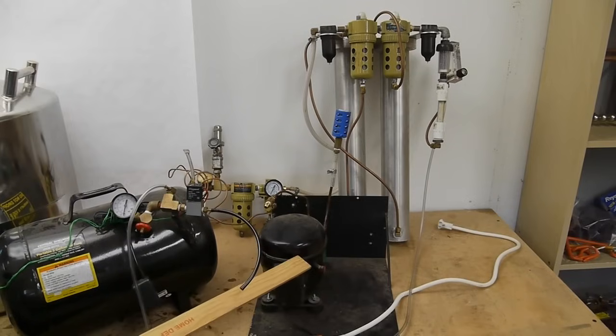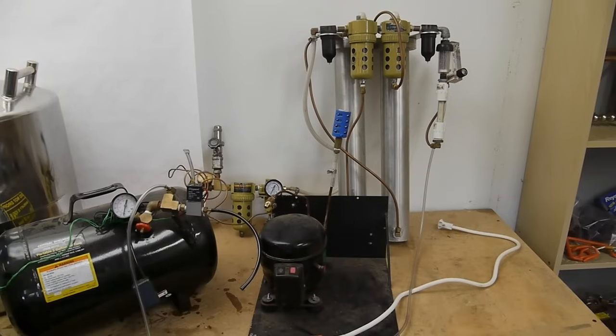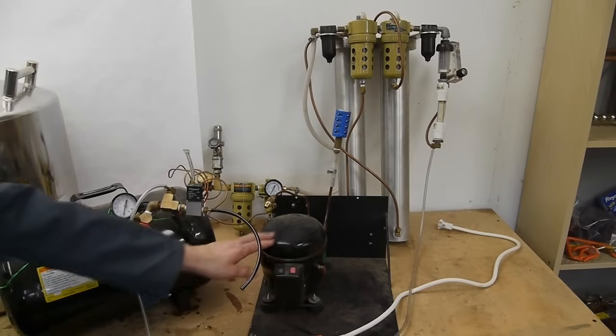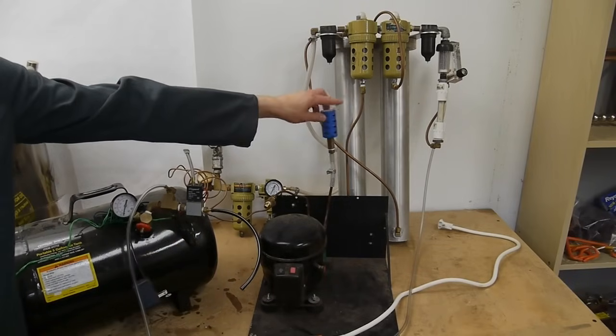So we start here with this compressor and the reason I didn't use my shop compressor is because this system has to run day and night and I didn't want the compressor to be noisy running at night. So these compressors are super quiet. This came out of a small air conditioner or maybe a refrigerator.